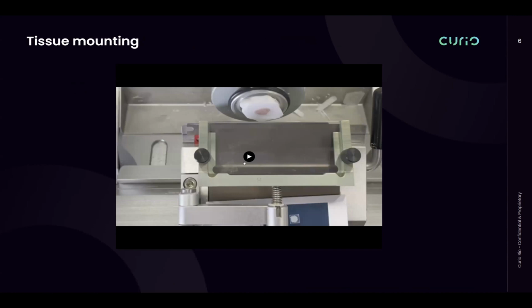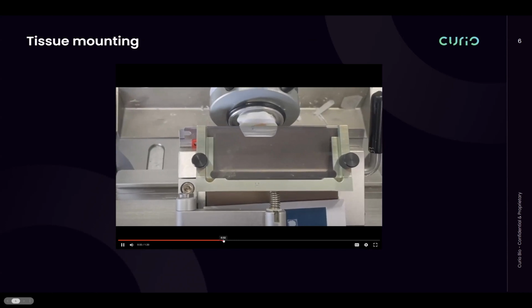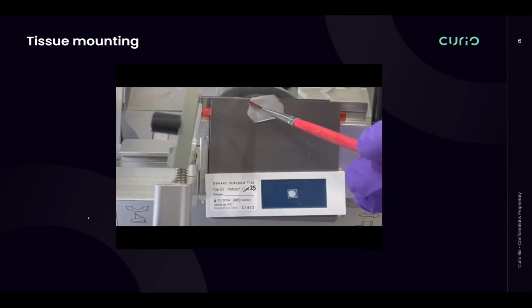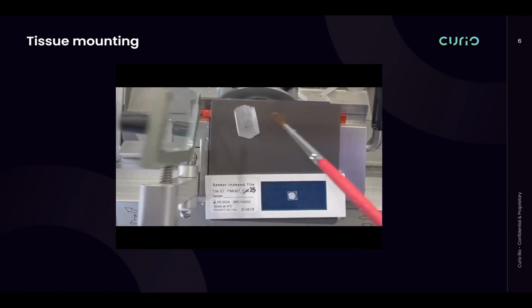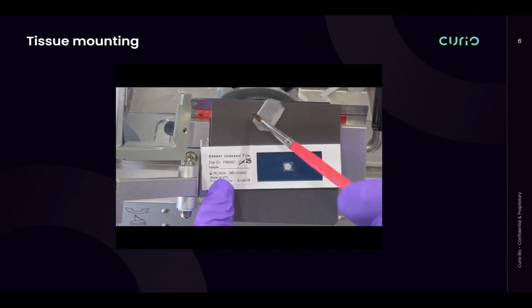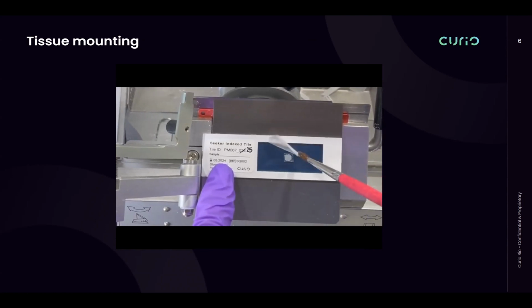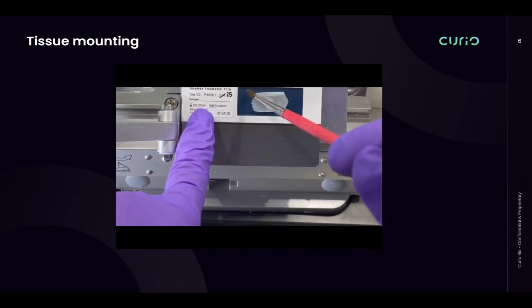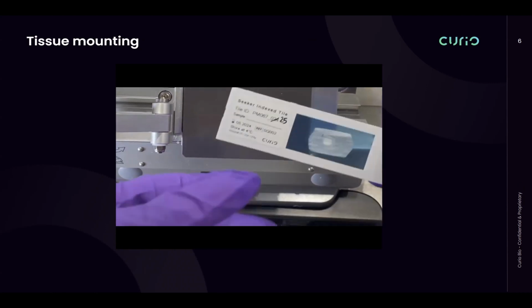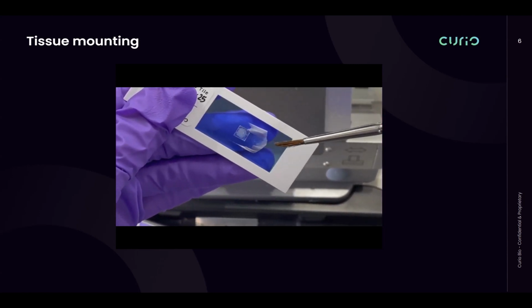And hopefully this will play correctly over the internet. What you'll do is section your tissue in OCT. It's a 10 micron section. What we usually do is after we section, we flip it over to prevent it from curling too much, because that will interfere with the melting process shortly. Because the slide is at the same temperature as the tissue section, you're very easily able to move it over the tile, over whatever area you're interested in looking at in your tissue. For reference, this is a mouse brain, which is larger than the tile, so you don't have to worry too much about tissues being larger than the tile. They can be as large as you want. You just need to know approximately where you want to place the tissue.